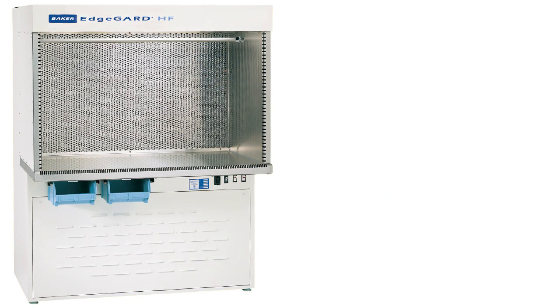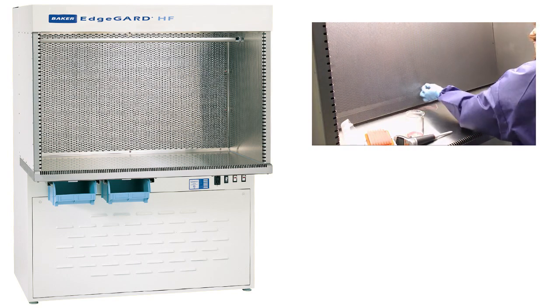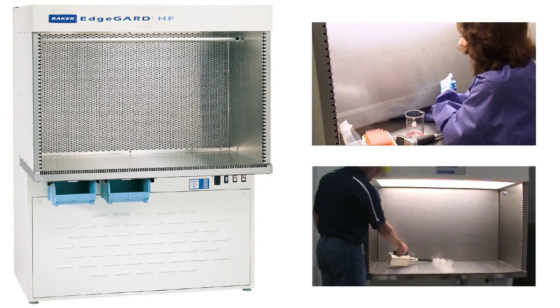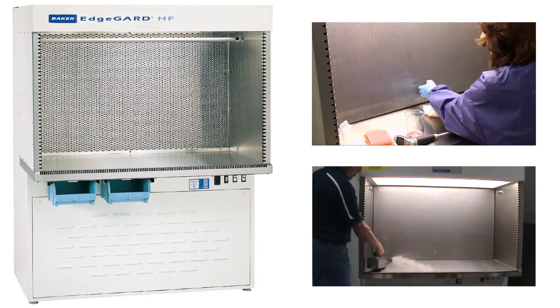Baker's EdgeGuard HF horizontal laminar flow clean bench with diffuser option ensures product protection and prevents cross-contamination for a variety of pharmaceutical, life science, and industrial applications.